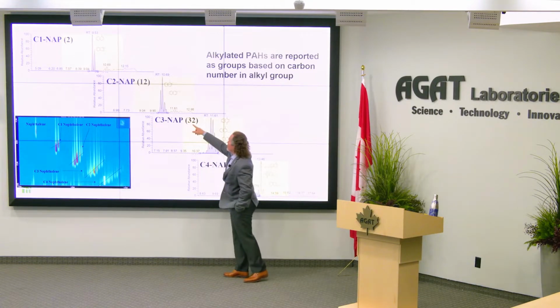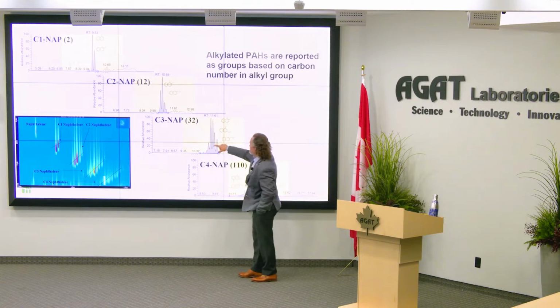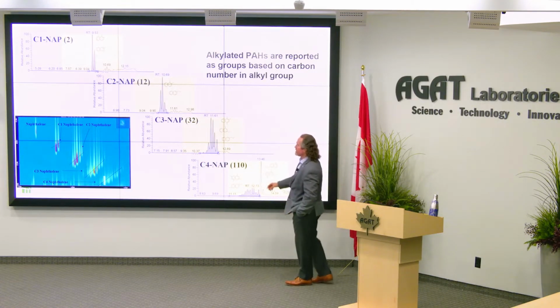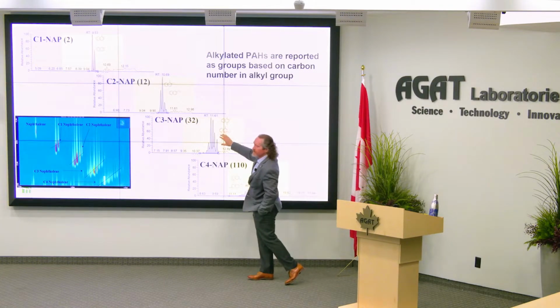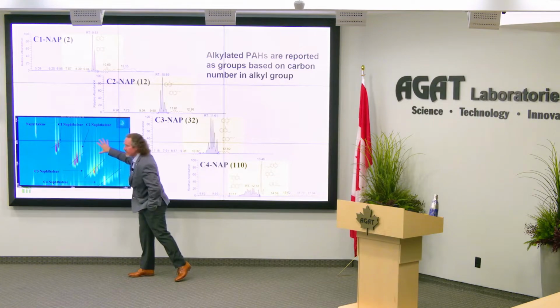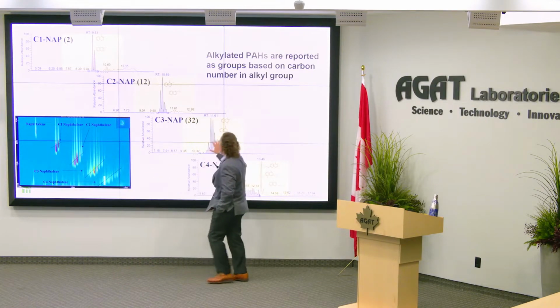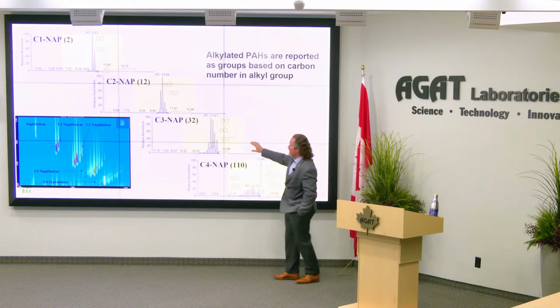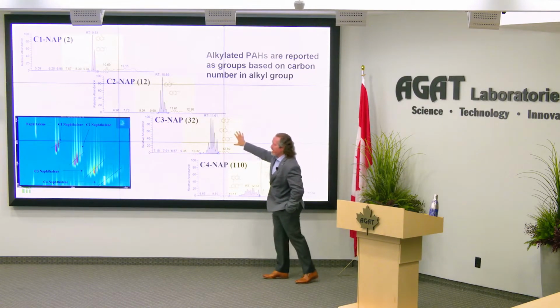C3s, where there's 32 of them, we just integrate. So these are these big humpogram, histogram plots that we do to be able to summarize the naphthalenes without going into the detail of measuring each individual compound in a GC-GC. So this is the one-dimensional GC chromatograms. If you're doing alkylated PAH analysis, this is the data that you'll be using.